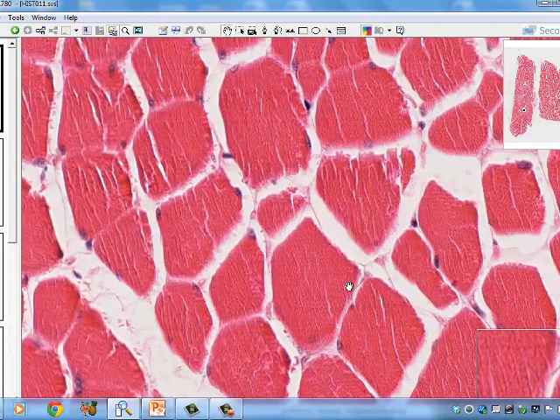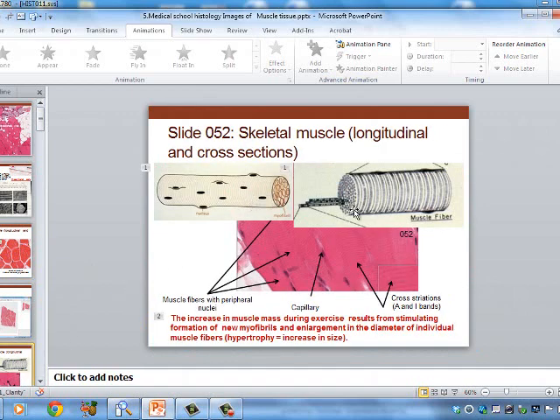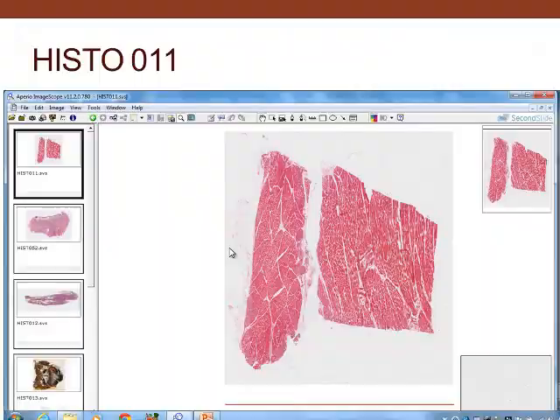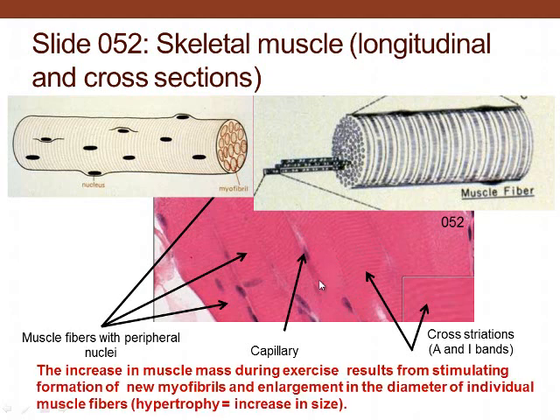Looking back at the slide, the muscle cell has its nuclei located on the periphery. Inside there are myofibrils, and the cross striations are the result of interactions of actin and myosin in the A and I bands. We can also see capillaries in there. Increase in muscle mass during exercise results from stimulation of new myofibrils — more myofibrils within the cell, not an increase in number of cells, but an increase in the size of cells.